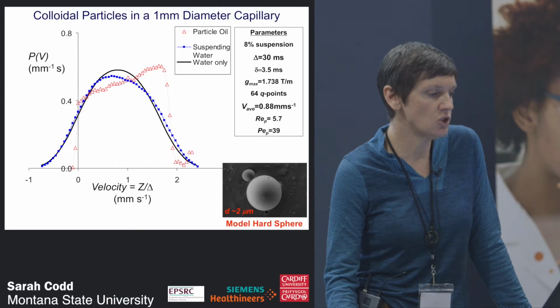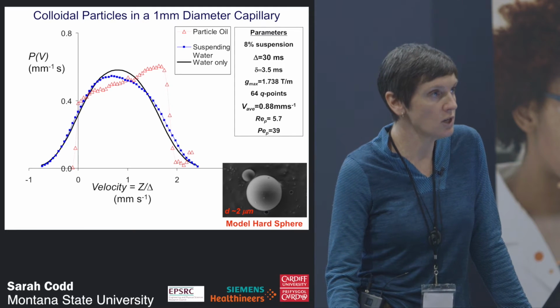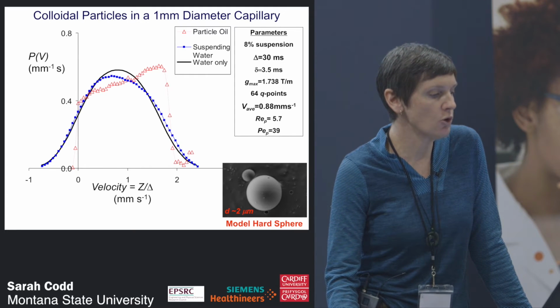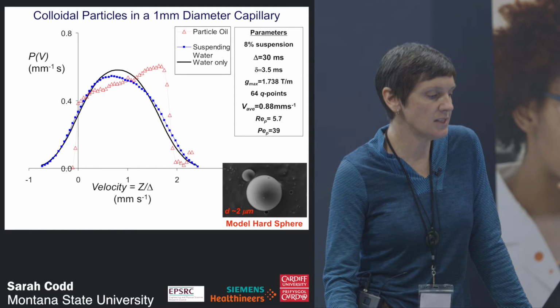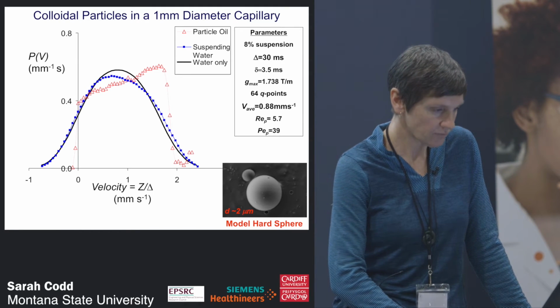And this is actually due to shear-induced diffusion across the capillary. These colloidal particles are centered more in the center of the flow, and you can see a corresponding decrease in the amount of water that's at the center of the flow.